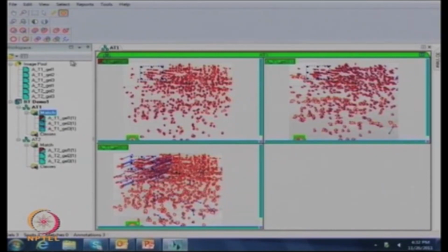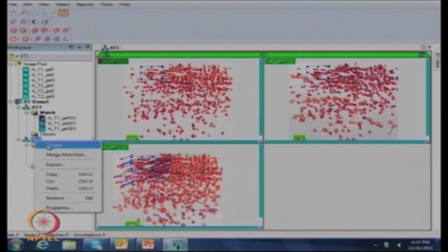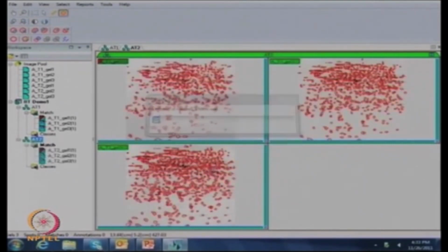Now we can save this and apply the same parameters to our treatment gels also. That's important, because you don't want to make any changes between your controls and treatments. There is no need to remember the parameters; when you detect your spots, it automatically gives the same parameters you used earlier. Same smoothness is 3, saliency 15, minimal area is 5. No need to change anything. Then click OK. Is it a long process of analyzing? It is quite quick. Then it's completely finished.